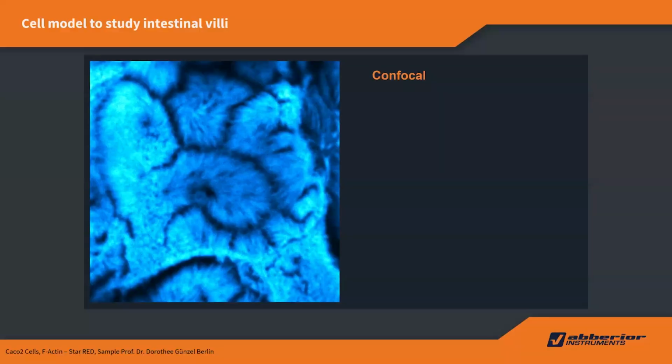And you can combine a lot of things together with this matrix detector. For example, this is the Caco-2 cell. It's an intestine cancer cell. If you stain the actin, you see all the microvilli. The microvilli absorb the nutrients in the intestines, right?